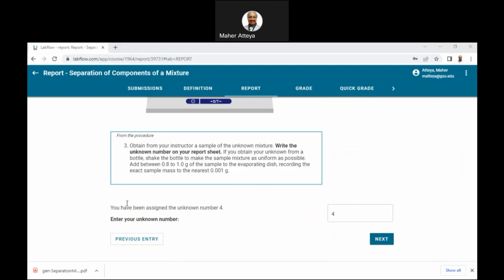So we are entering the unknown sample number, and click next. So we take this one here, copy this, then paste it, take it all over here. Okay, good.